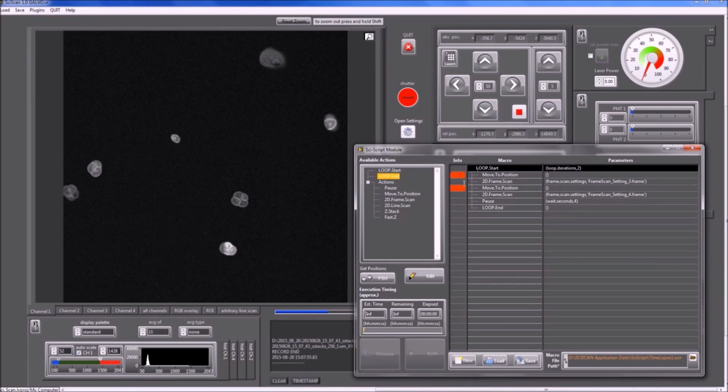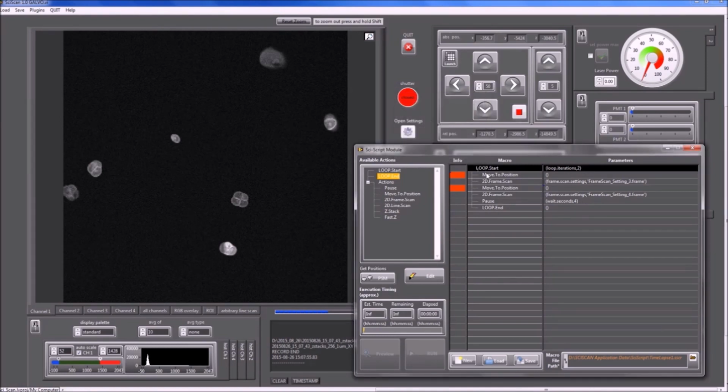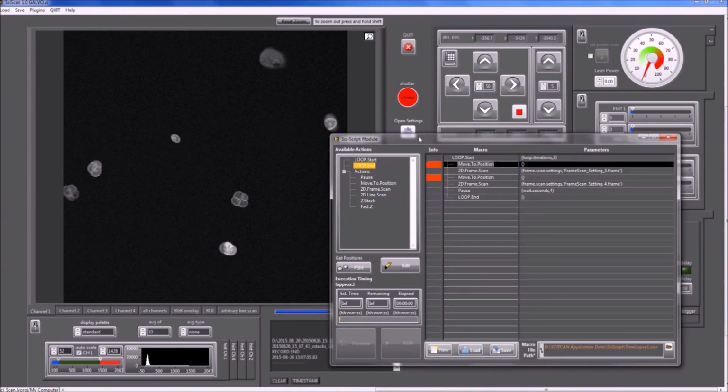So you can see that clearing the position has created 2 errors. So to know what the error is, you could go and click in the info table, and it says that you have incorrect number of parameters entered. It's because all the position details are gone. So to clear the error, you could click on the command and then click edit like we have seen before.